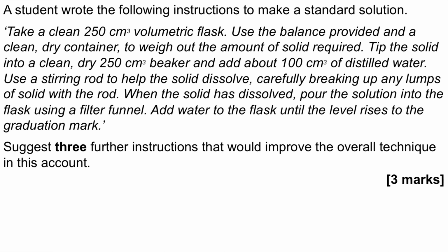Use a stirring rod to help the solid dissolve, carefully breaking up any lumps of solid with the rod. When the solid has dissolved, pour the solution into the flask using a filter funnel. Add water to the flask until the level rises to the graduation mark. Suggest 3 further instructions that would improve the overall technique in this account.